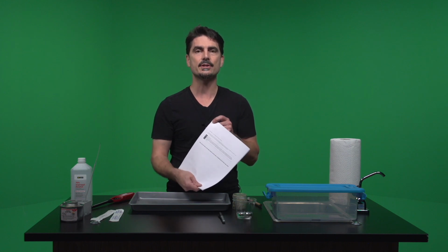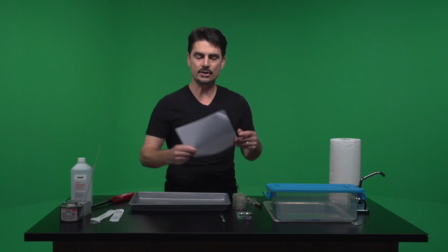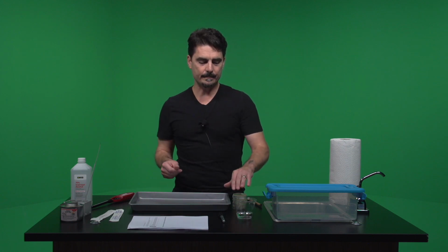From that perspective, please, please, please print out your lab guide for every lab and follow the written directions. Now certainly, read it online and understand it online. There's different colors and things like that, but when it comes time to doing the lab and annotating it, use the hard copy. Okay, so we have our plates.